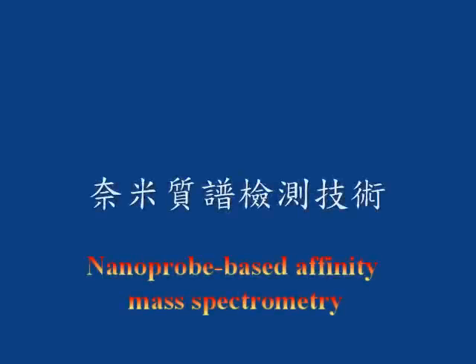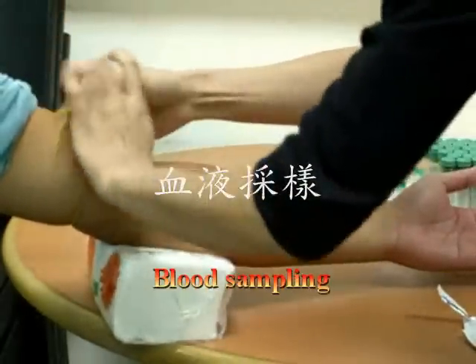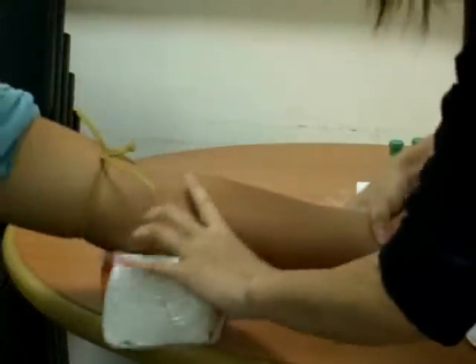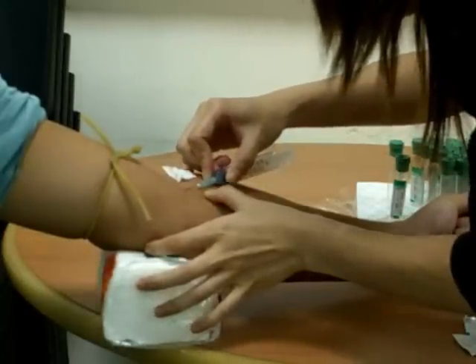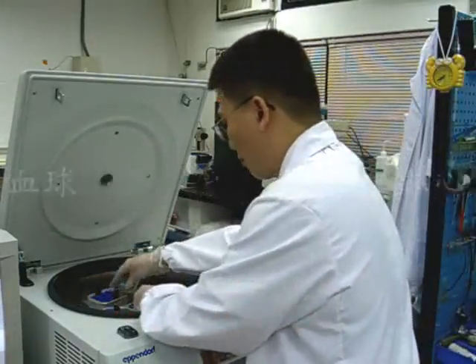Nanoprobe Based Affinity Mass Spectrometry. First, sample preparation: draw blood from patients. Then, use a high-speed centrifuge to separate serum and blood cells.